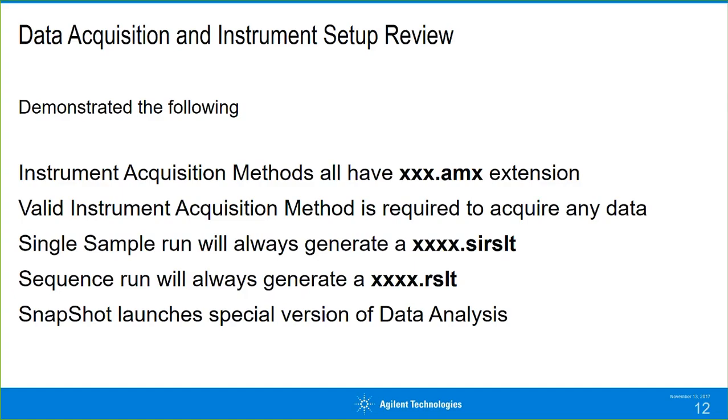All right, we will just continue on with more of the data acquisition and loading samples. So this, again, we go over a couple of the information with the slides. Then we go in and we do the demo. We have some questions, and then right now what I like to do is to kind of tie in what we did on the first section, right? This becomes very useful, especially if you're looking at this recording in the future, of knowing the steps of where to go and actually get some of your data.